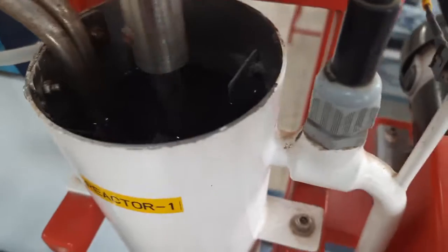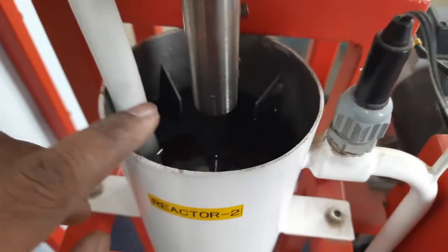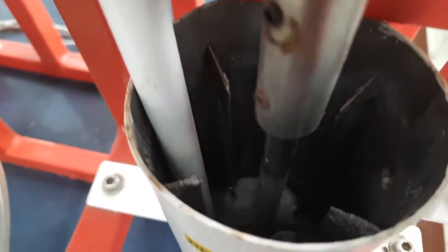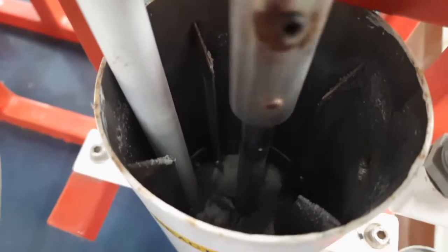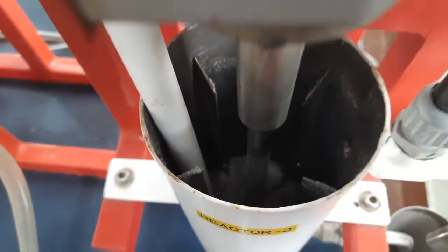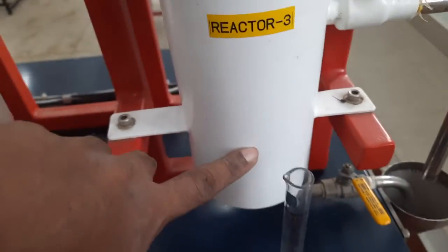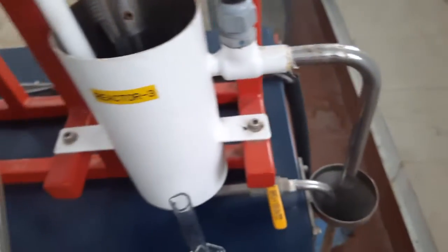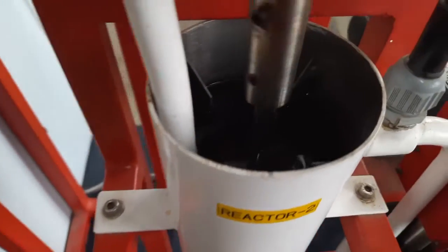What we can see is that the first reactor has filled up to the baffle level, the outlet stream level. The second tank has also filled up to this level, so the product is getting into the third reactor as well. In the third reactor we have a certain level filled with the reaction mixture. Once it comes up to here, we will wait for 5 minutes to collect the sample and do the titration.